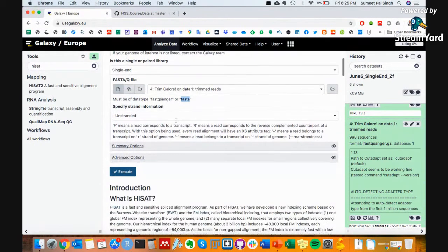And this kind of sequencing was done unstranded. So that means there was no preference for the strand. If you are using random hexamers, then most of the time it's unstranded, but you can always ask the person who did the sequencing or the platform about the strand. But in this case it was unstranded. This is information that you'll most possibly get from the platform.